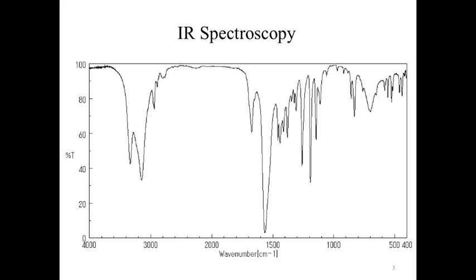The next part of that, I do notice that this is broad, which is typically characteristic for an OH. Again, that wave number is really, really low. So again, I'm kind of perplexed by what's going on with that. So that really kind of leaves me saying that perhaps what I'm seeing out here is some CH sp2 stretches.